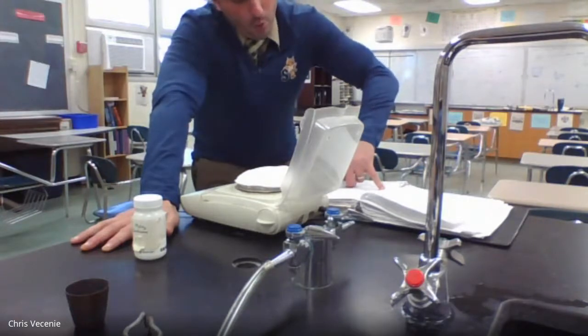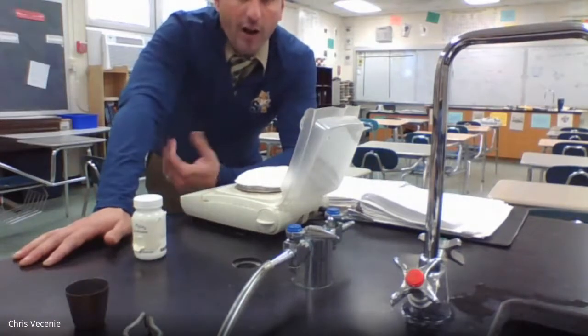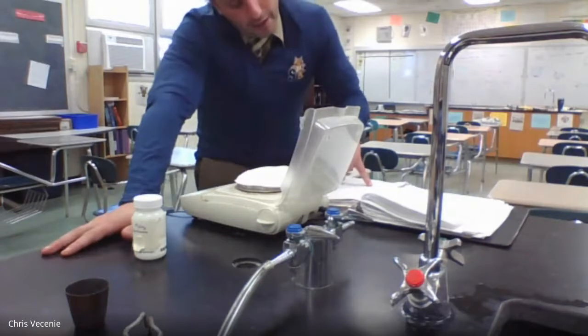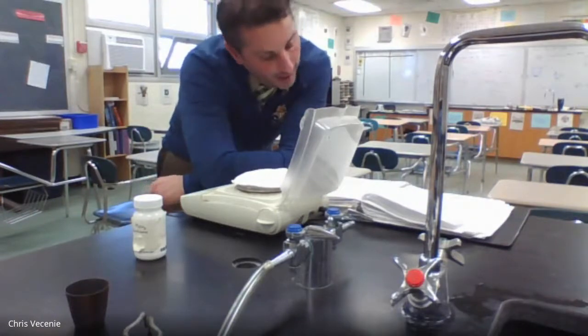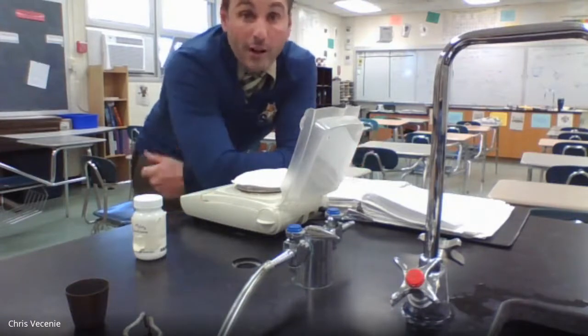So 2.19. Then what we would do is put it back in and heat it one more time for another 5 minutes just to make sure. Let's hypothetically say I did that, heated it up, and I'm going to mass it again. Now the number is 2.19 again. We have heated it enough. So your mass of filter paper plus CaCO3 should be 2.19, and the mass after the second weighing should be 2.19 as well. From there, it would just be cleanup, tearing that down.